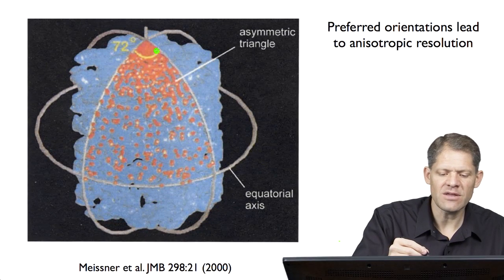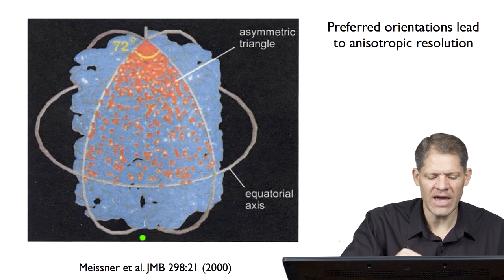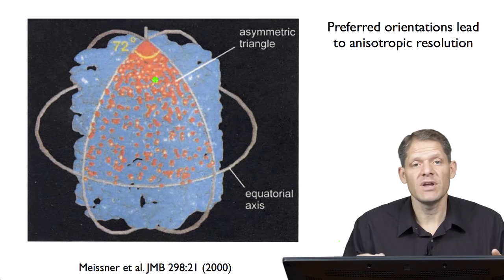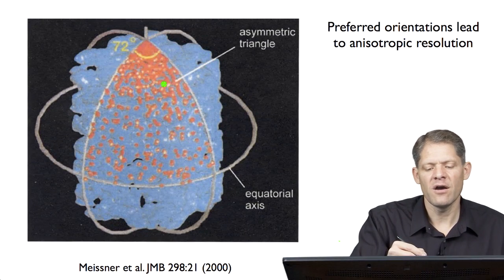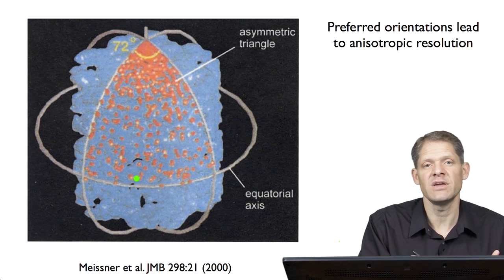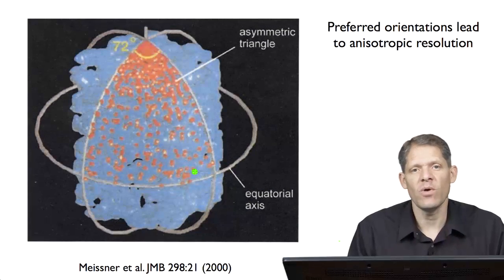And as you can see, there is a preferred orientation. Lots of the particles lay on the grid such that they were imaged from the top, more or less down the axis, or at least closer to down the axis than from a side view. So in a case such as this, one must be careful that the extra images recorded from this perspective are not overweighted compared to the views that were more sparsely represented. Instead, the information coming from all the different views has to be equally weighted.